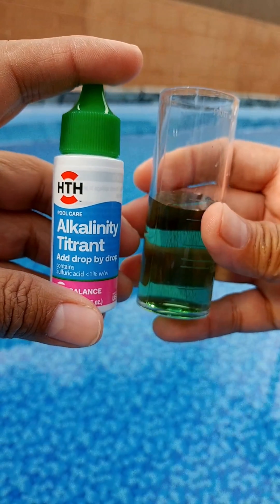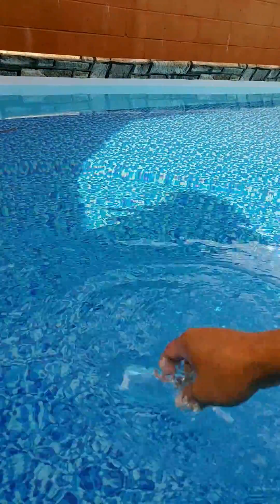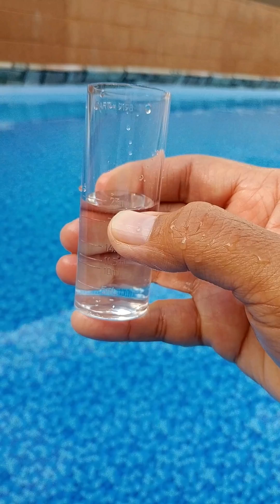This is how you test the pool water's alkalinity using the HTH liquid test kit. Step 1: Rinse and fill the sample tube to the 25 ml mark with the water to be tested.